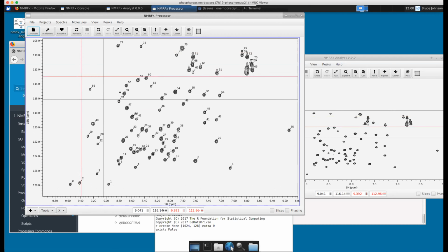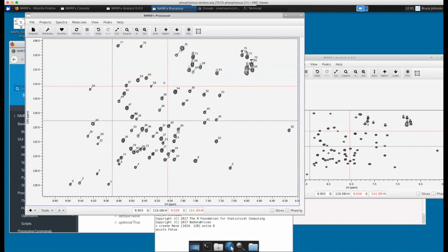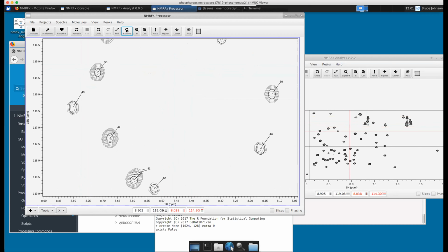Bruce? Yeah. Just a very basic question. So the black and red cursor you get, is this right and left? Left and right? That's a good question. Sorry, there are a million things that I'm skipping over. By default, when the program starts up, if you click with a mouse button, you're going to get the black crosshair. If you click a distance near that crosshair, you'll move it. If you click some distance away, you'll get a red crosshair. I'm doing that with my left mouse button.